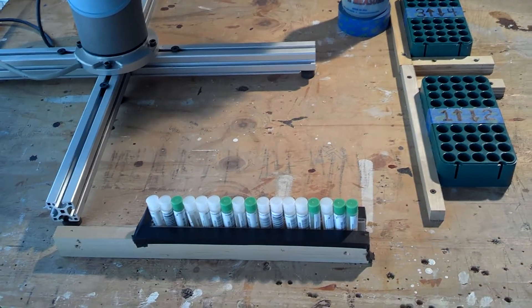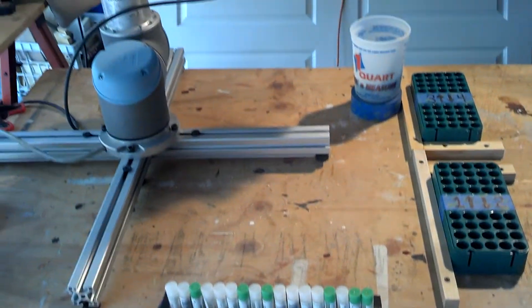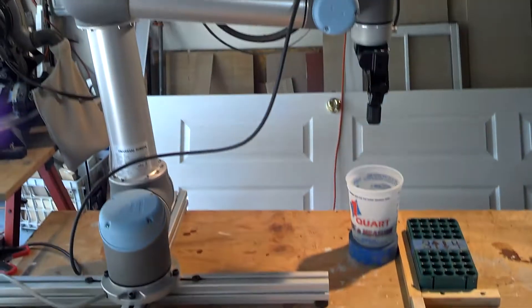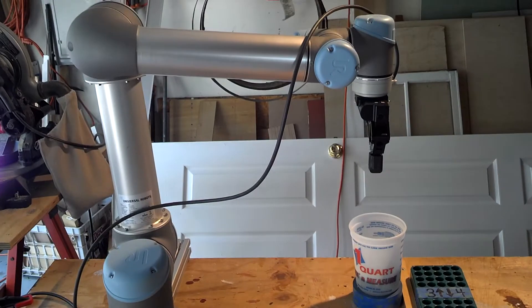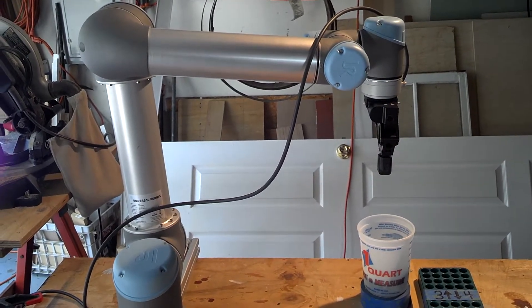Okay, so here's the setup for Quest Diagnostics. Pick and place sorting of their test tubes.